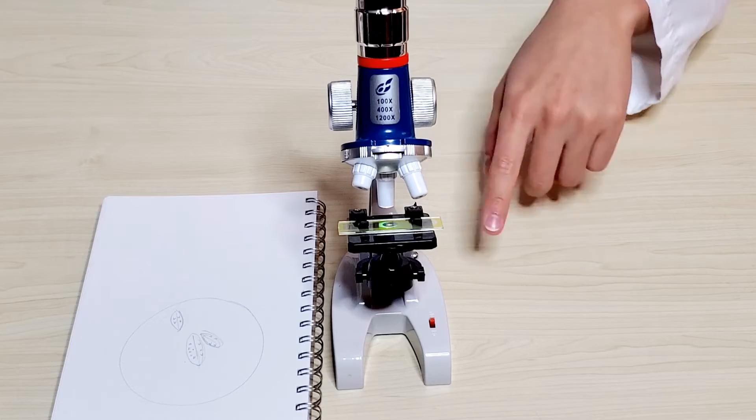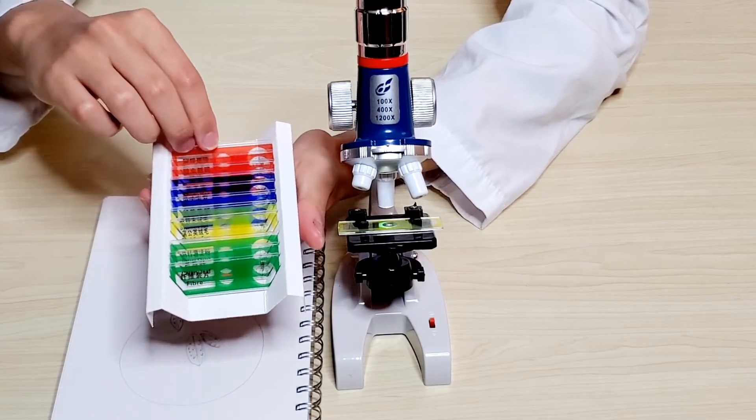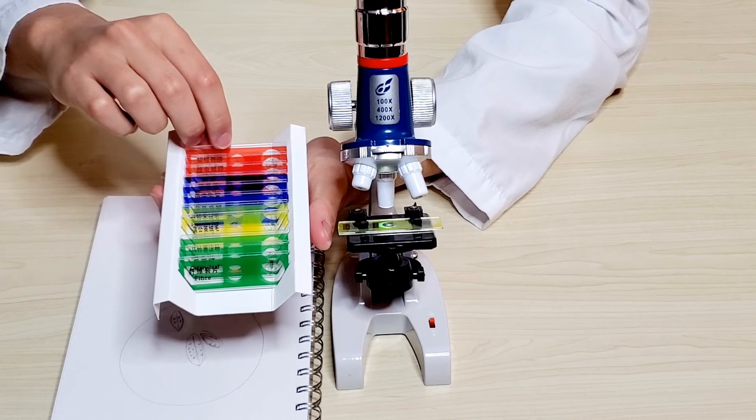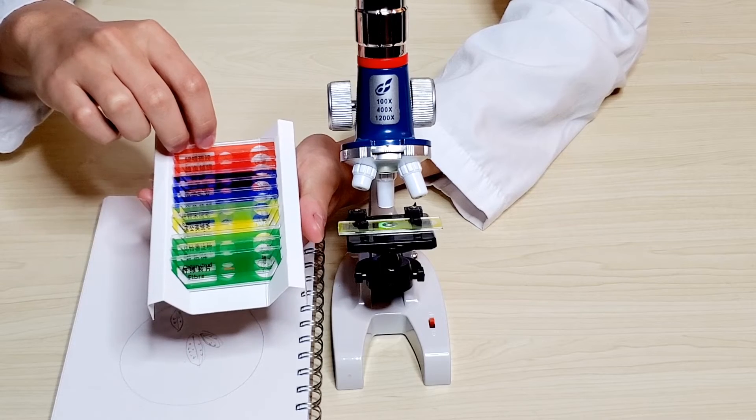Not only can we inspect the lily pollen, we can look at other things like insect wings. We can also bring in the sample glass and take a sample of ourselves — for example, we can look at hair or even a cockroach leg.